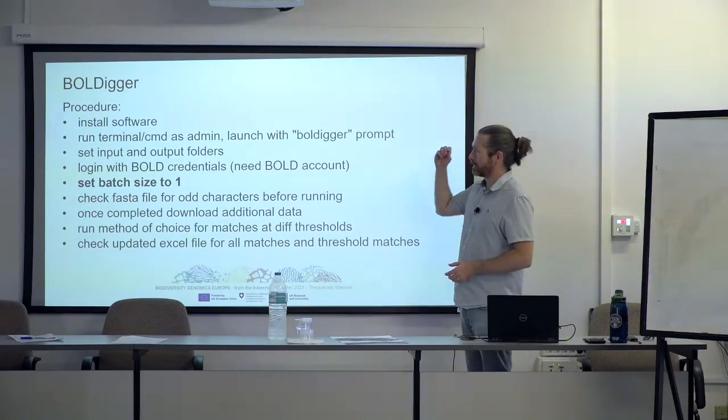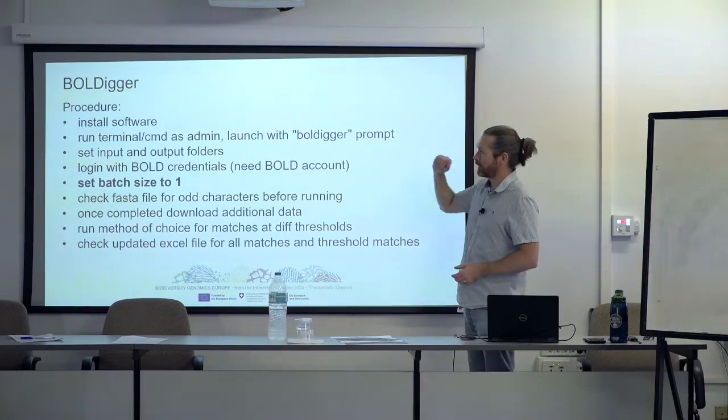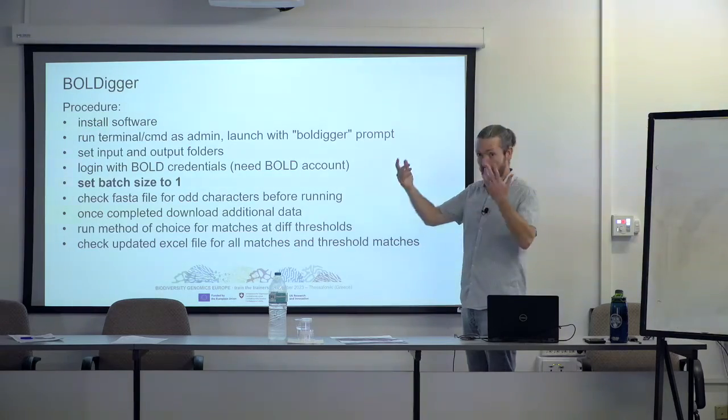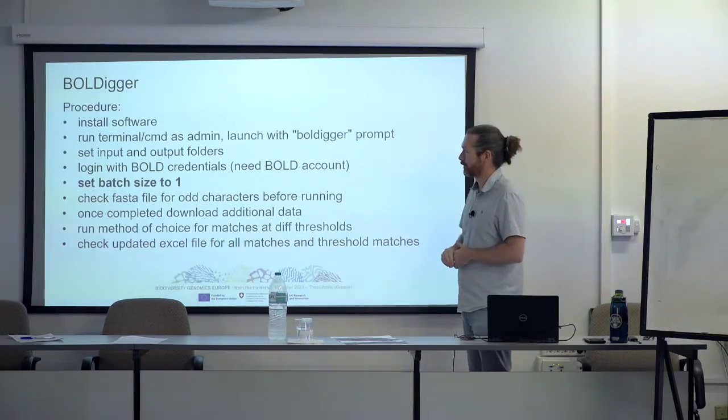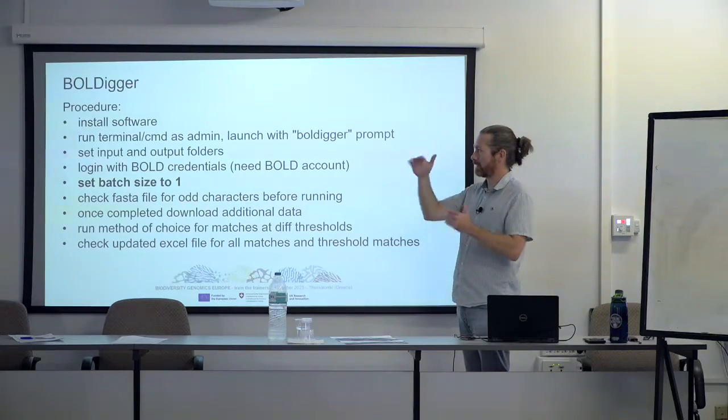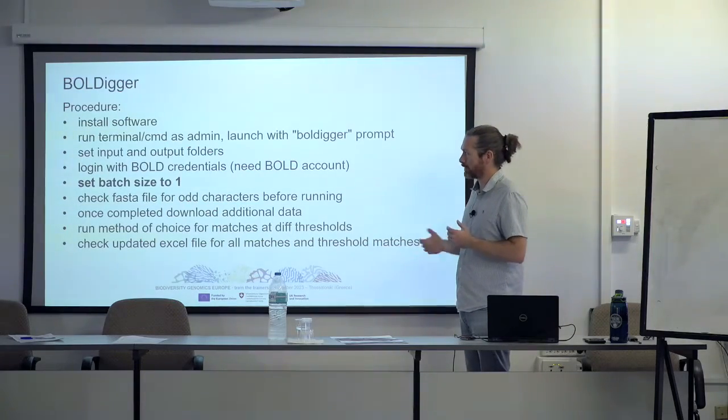So you can install it. You have to use the command line to launch it, but it's relatively straightforward. You just get in there as an admin and type Bold Digger. You set the input and output folders. You log in with your credentials.